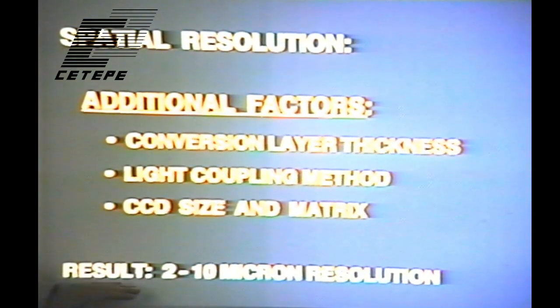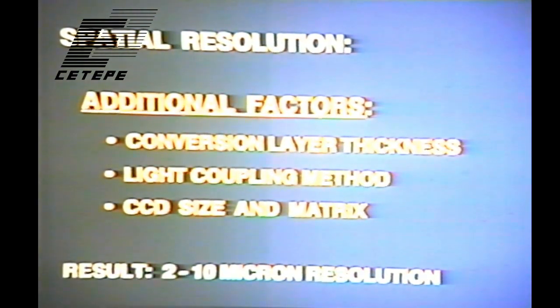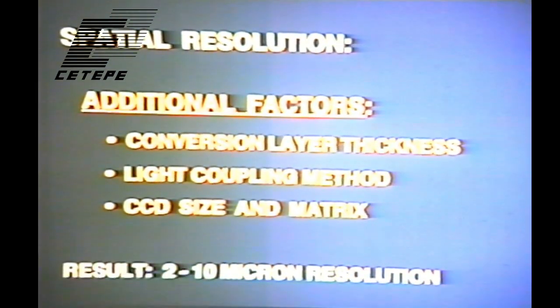So if you really did everything perfectly, and I don't know of anyone in the world who's achieved this in CT, but if you did everything perfectly and you got lucky, I think you should be able to get resolution in this kind of range, with a 1 micron or slightly less than 1 micron source. But it's very, very challenging, so no one's done it. I certainly haven't.